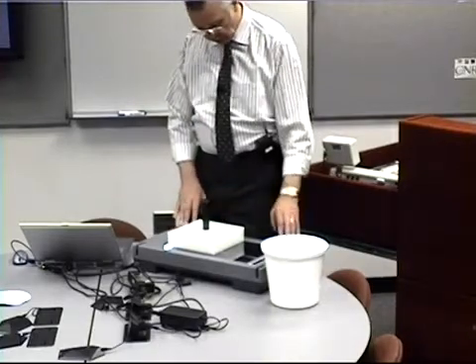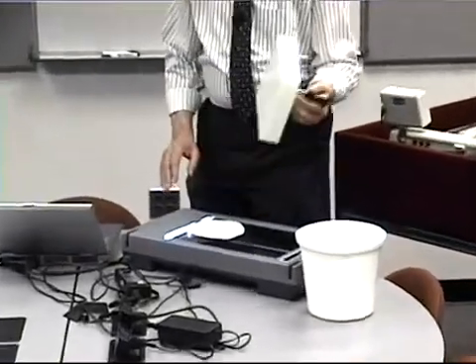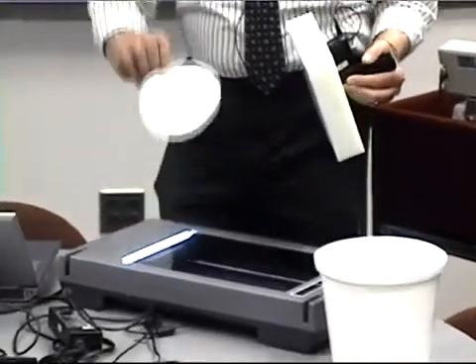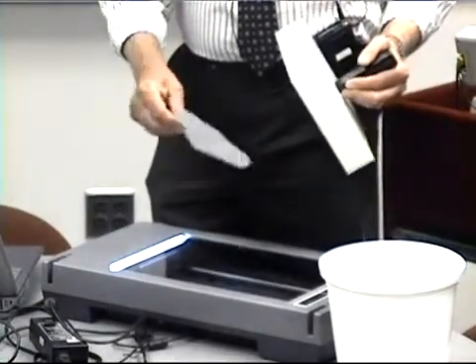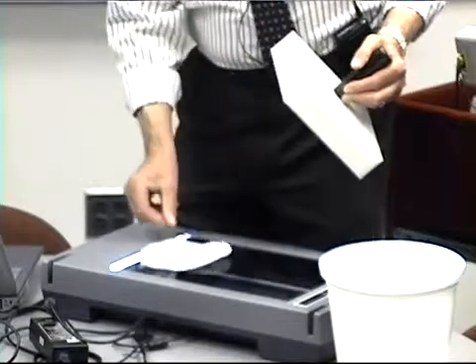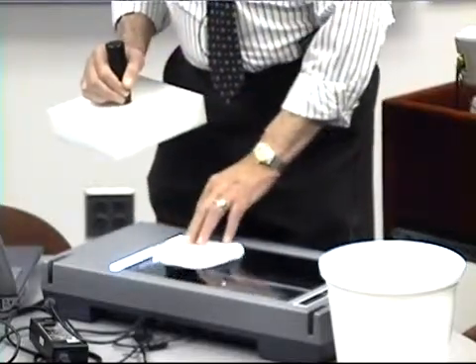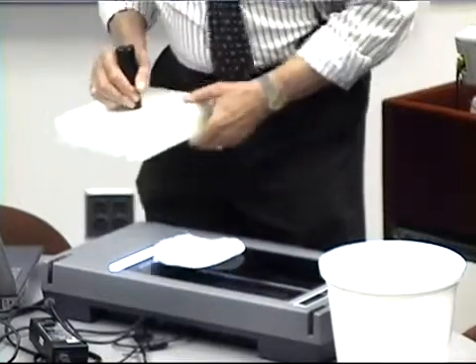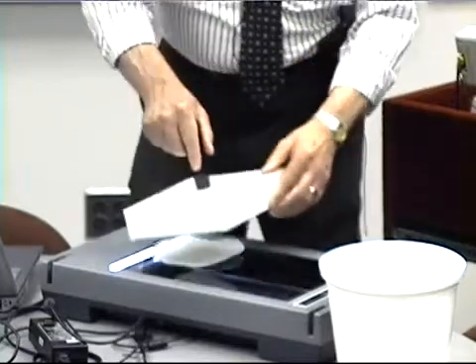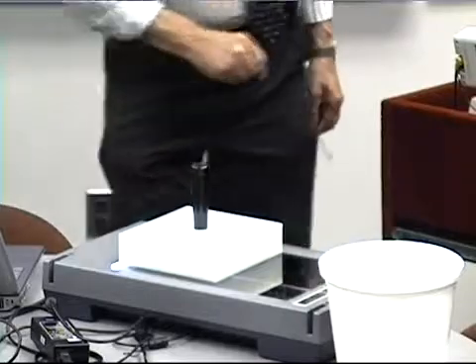You'll notice that it is fitted with a block used to hold down the specimen. The specimen, as you can see here, is quite wrinkled. This scanner is different than most scanners. There are a few of them out in the market that have on them two bulbs. Inside this scanner, it has two bulbs, and I'll explain this a bit on the slide.